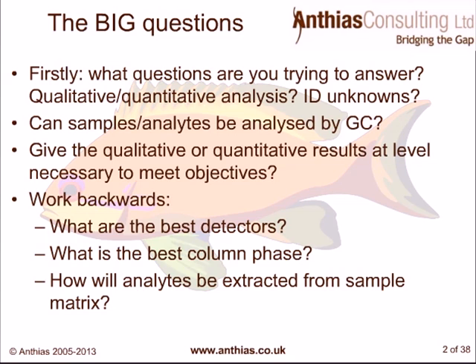Do you want to identify unknowns? First of all, can your samples and analytes be analysed by gas chromatography? Or would another technique like liquid chromatography be a better method? Does the GC method give the qualitative or quantitative result at the level necessary to meet your objective?